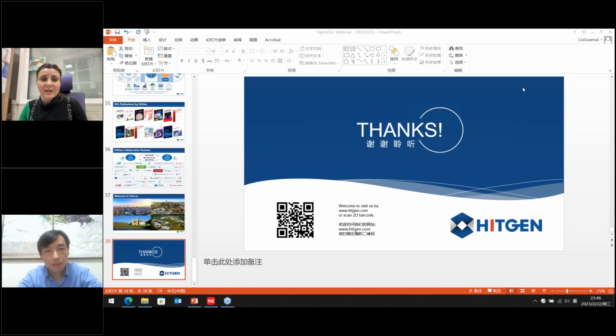Another question I have is about quality control. How can you check whether your DEL libraries have good quality or not? Could you please elaborate a little bit more on this? Yeah, sure, this is a very good question. Before the library construction, we have a lot of quality control. The first one we call chemistry quality control, because in the library construction thousands of different building blocks will be used.